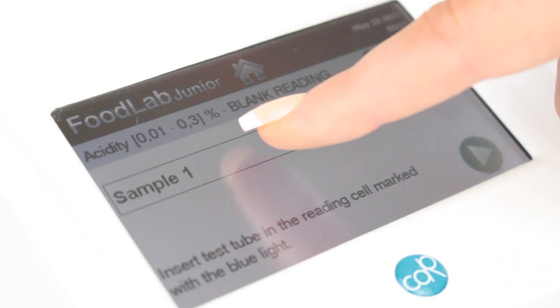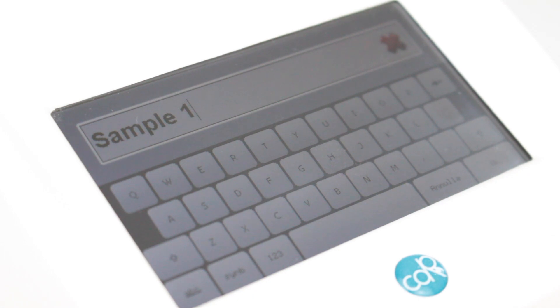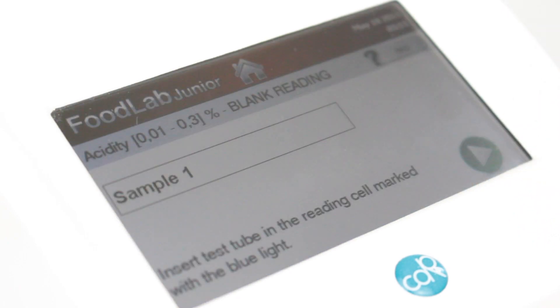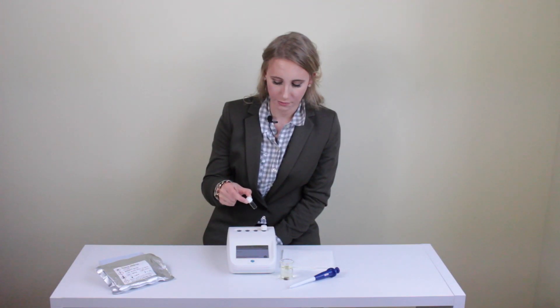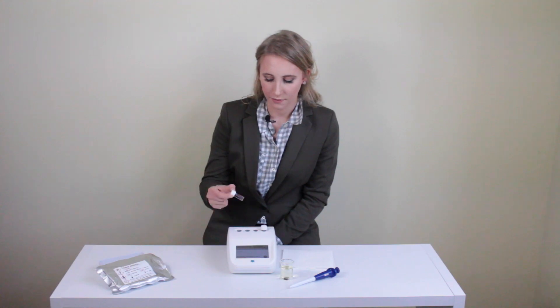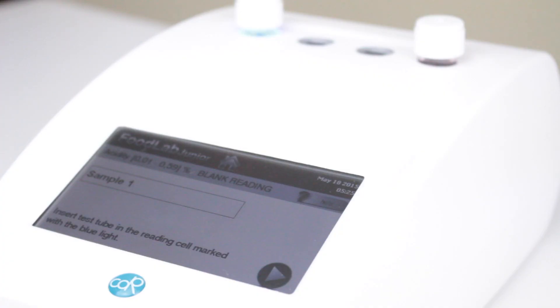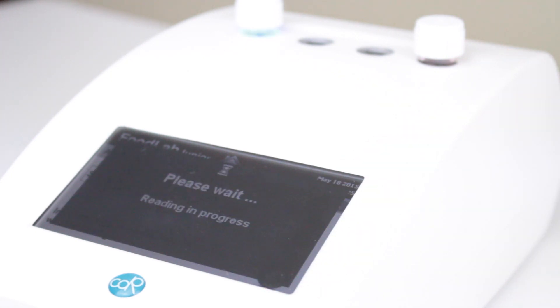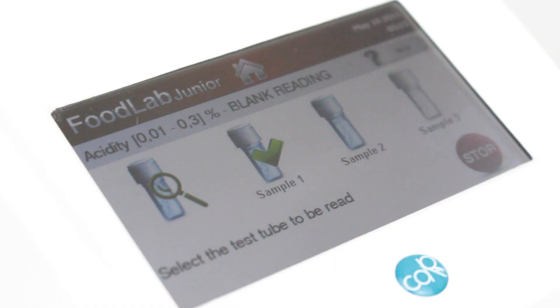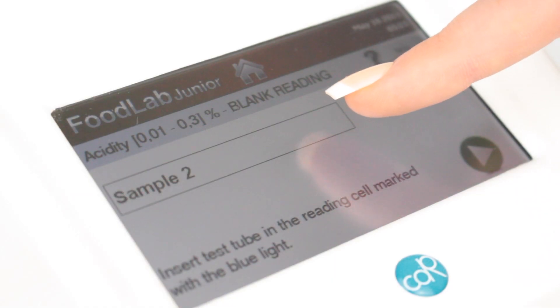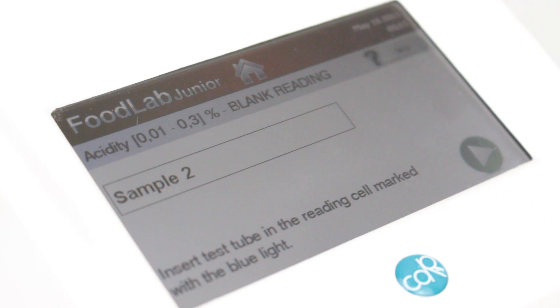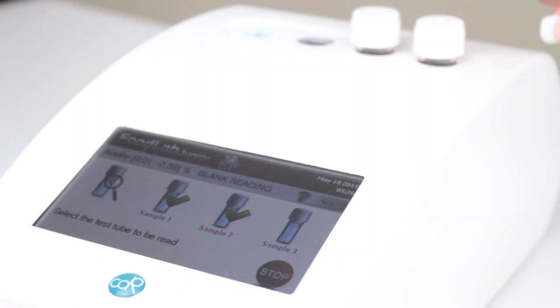Next you'll perform the blank reading. For this you'll simply select Sample One — you can change the name of the sample if you'd like, or you can keep it as Sample One. Take the reagent cuvette you'd like to use, invert it, and place it into the blinking blue reading cell, then press the green arrow. If you'd like to test more than one sample, you can repeat the same step for Sample Two.